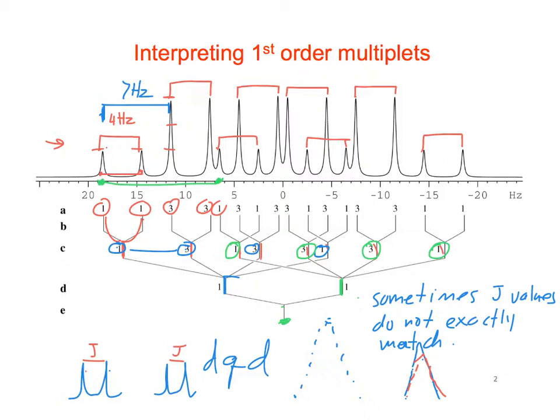Yeah, I'm sure. And I'm confused on how, I don't know if we talked about this yet, the difference between zero filling and line broadening to weight the beginning part of the FID. Are they connected? I think what we'll do is have Casey come in and maybe talk about some of that stuff, because they are different. Line broadening, the LB value in hertz, is different than zero filling, correct? Yes, definitely. Okay.